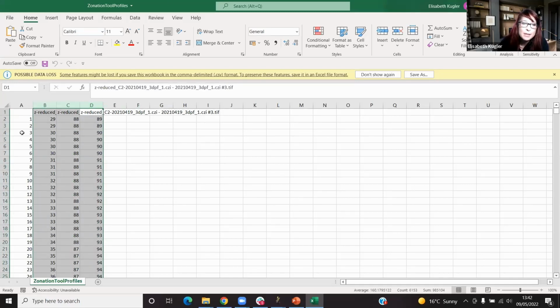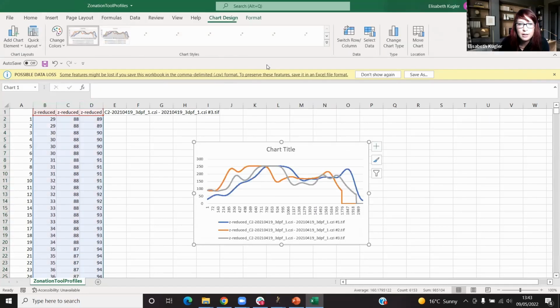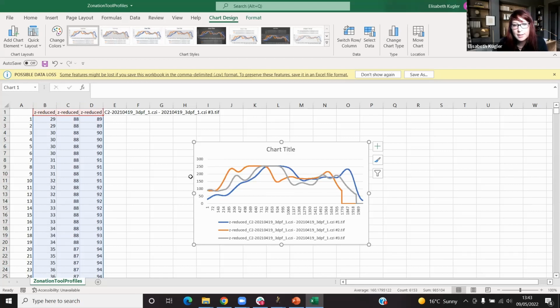But what it will have done is basically plotted all your data from the top to the bottom as intensity profiles. And if you go to insert now in Excel, it will give you a chart like this. So just as a kind of reference, what we're looking at, in this case, each individual line is a different image from the different embryos, and left will be the apical part, and the right bit will be the basal part of the retina. And this is just intensity.